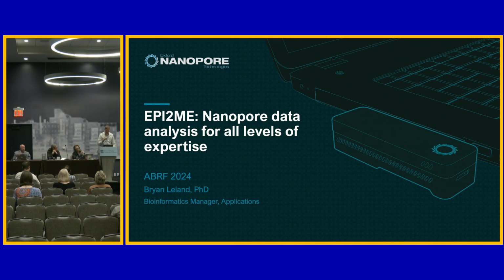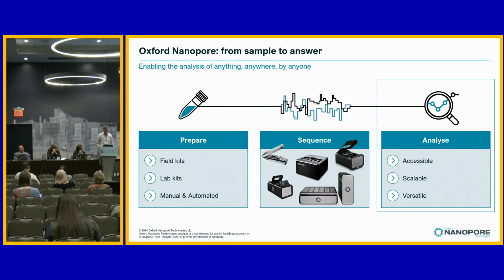All right, thank you for that introduction. Thanks to the organizers. Can you guys hear me in the back okay? All right. So today I'll be talking about the analysis tools we have for nanopore data, EPI2ME, and how they can be used by anyone at any level of expertise.